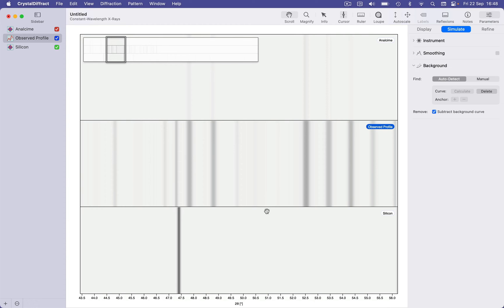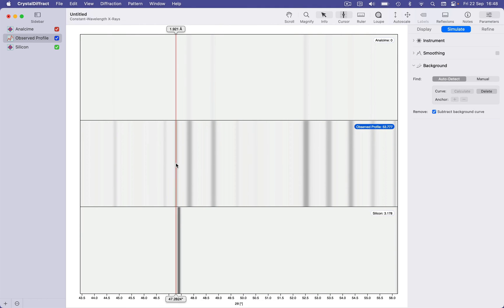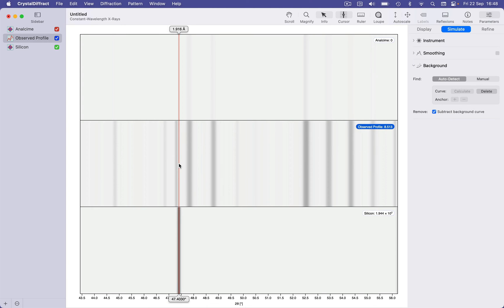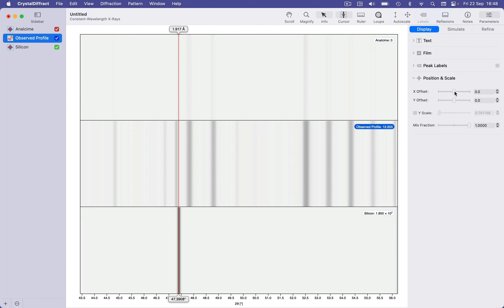The lines match up quite nicely for Analcime and Silicon, but there's a slight offset — ideally the silicon lines would match up exactly. We can look at the difference between the observed and simulated patterns, go to the display inspector for the observed profile, and adjust an x-offset or zero shift so that the pattern is calibrated against the internal silicon standard.